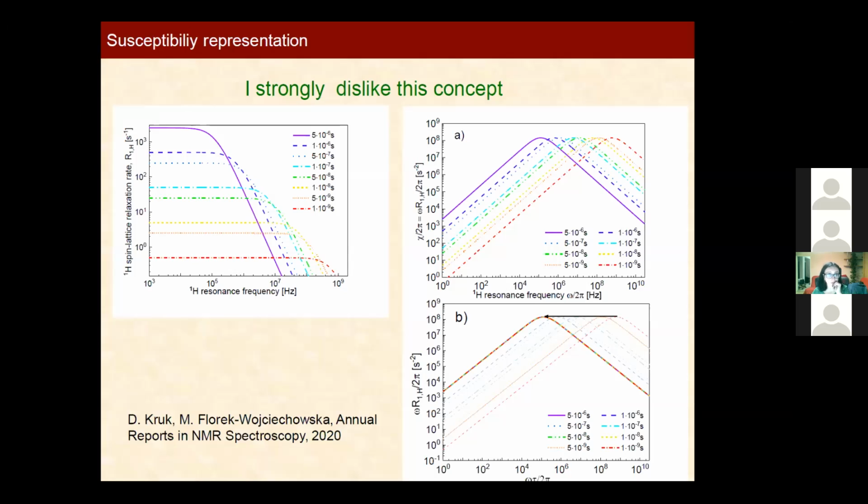Well, so what to do now? Actually, so far it's not really very interesting, because we decompose those data into those Lorentzian functions. We show that we can very nicely reproduce the quadrupolar peaks. But can one really believe in that? So we decided to compare the results with dielectric spectroscopy results, which were supposed to give information about molecular reorientation.